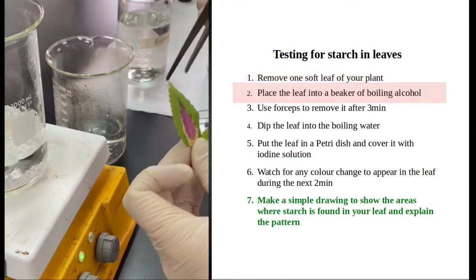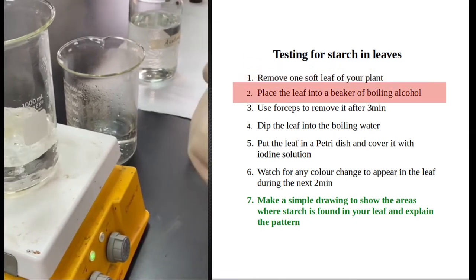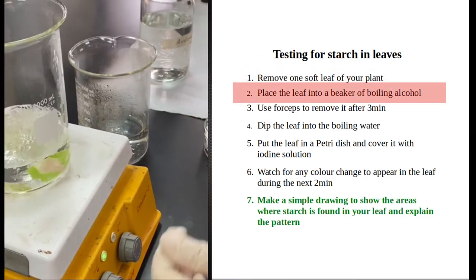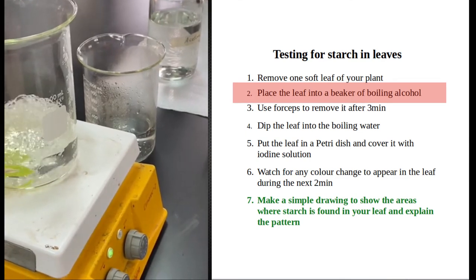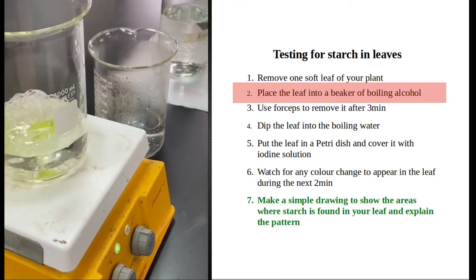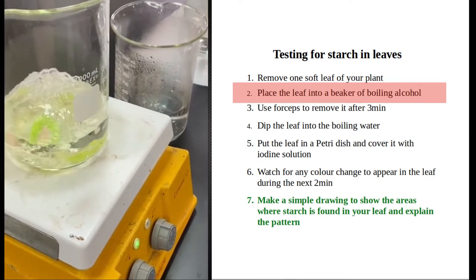I will dip those leaves in boiling ethanol to remove their pigments - their chlorophyll and the purple pigment as well. When this happens, I will remove the two leaves and dip them in hot water.